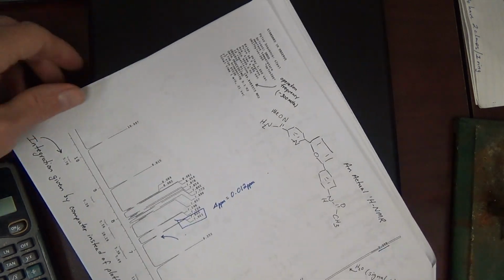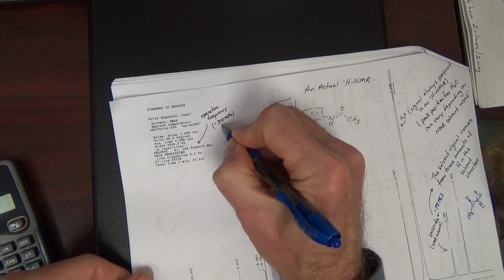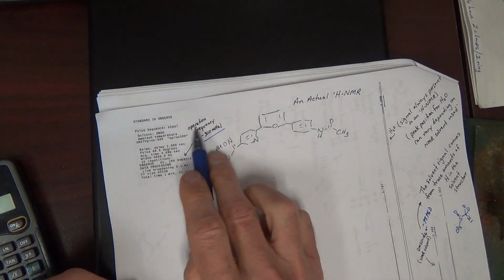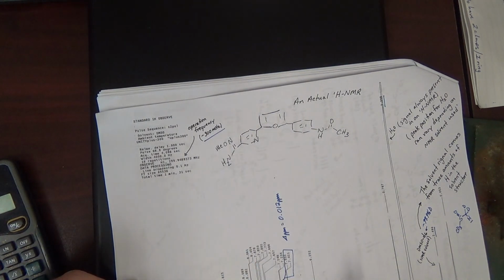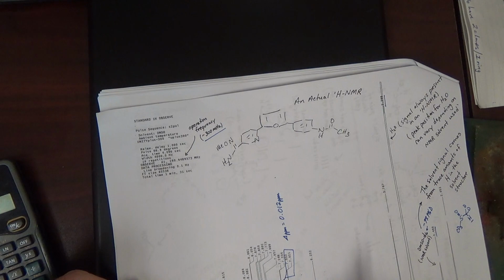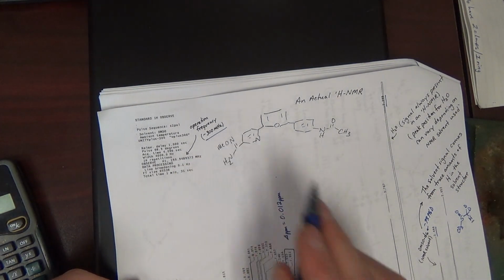We are using an instrument that is 300 megahertz. That's the operating frequency, the size of the instrument. This can vary. More money, bigger the value here.